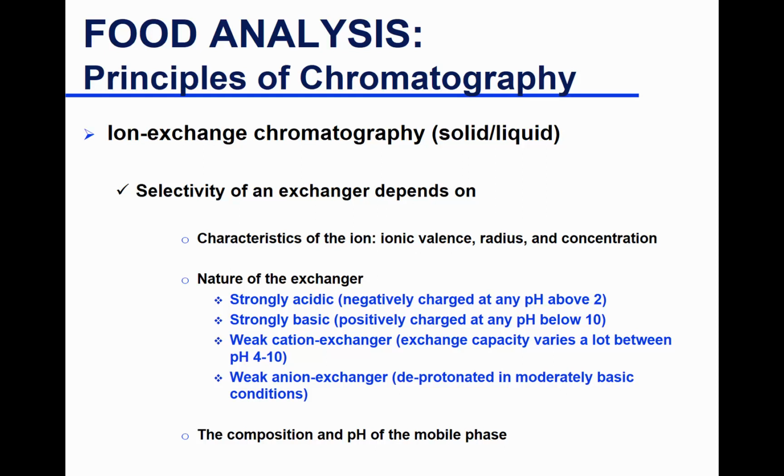Concentration. The higher the concentration, we have to be careful. I think we talked about this last time maybe, we cannot inject a sample that is very concentrated, because if it's high in concentration, there will not be enough capacity on the column to interact with all of the molecules in your sample. So some of the molecules, even though they're charged, will not find room to interact and will elute. So you have very poor separation. So concentration is really important to take into account when you inject a sample on your column.